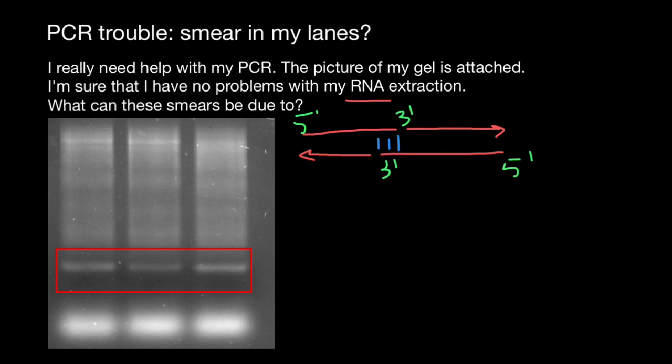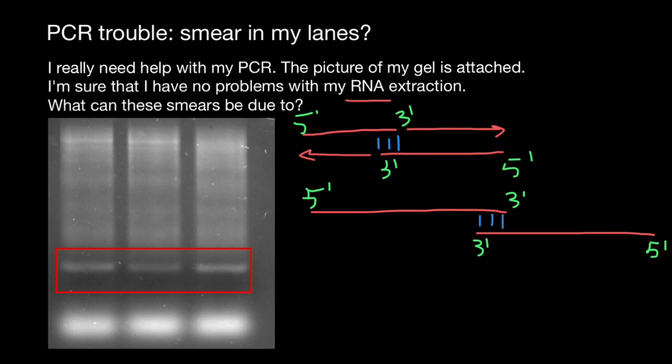We get double-stranded DNA, which in the next cycle also has a five-prime end and a three-prime end. Again, they would have some homology at the three-prime ends, and Taq polymerase would extend one strand and then another strand, producing a three-prime end each time. So as you can see, with each cycle we are going to get a whole range of sizes, and we are going to get a smear like this.